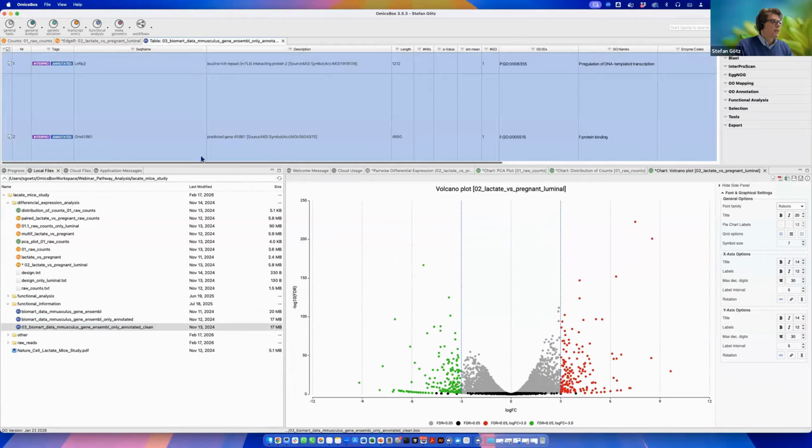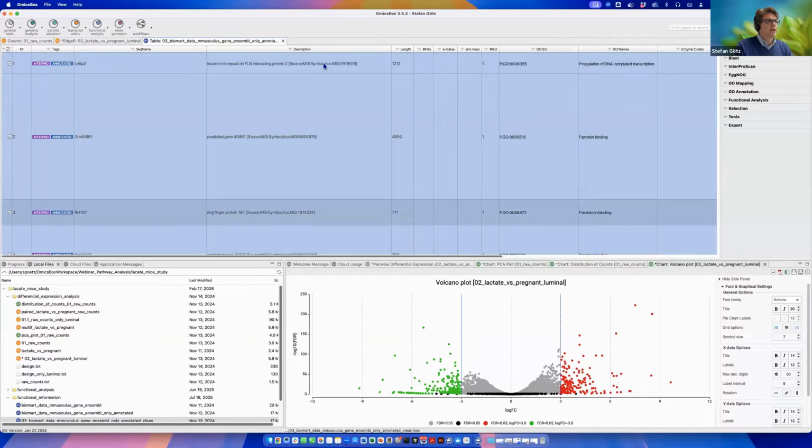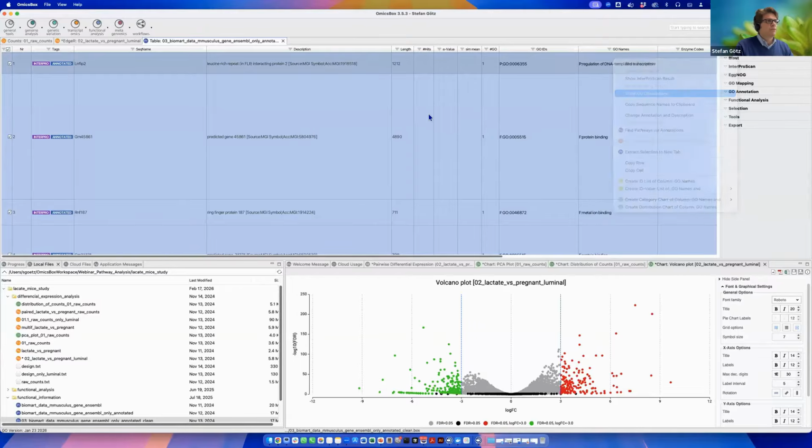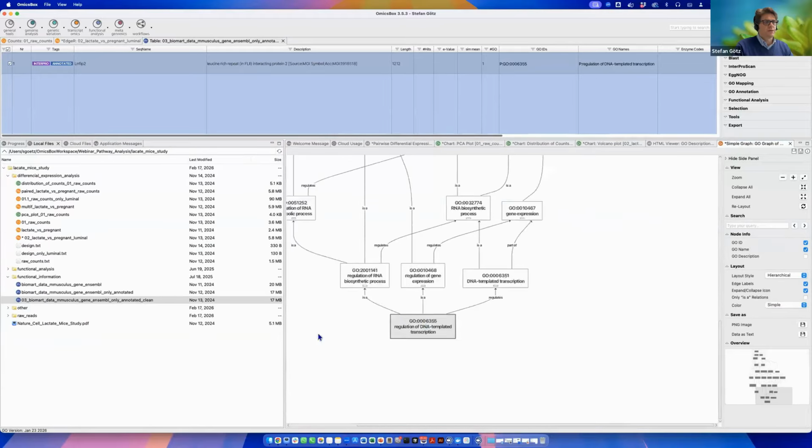And then I just get them like this. In this annotation project, I already showed you, so now you can see this in action. I have my project here, and then for each sequence, I can show you the gene ontology terms, which are listed here, okay?